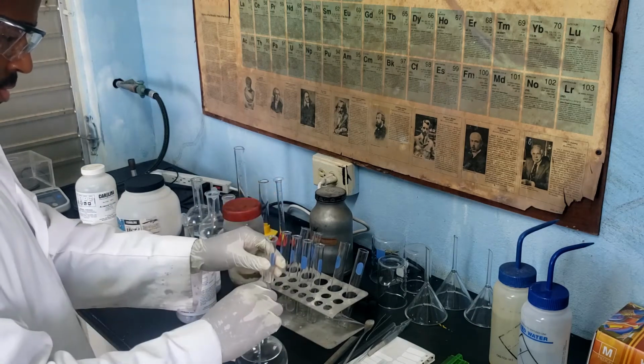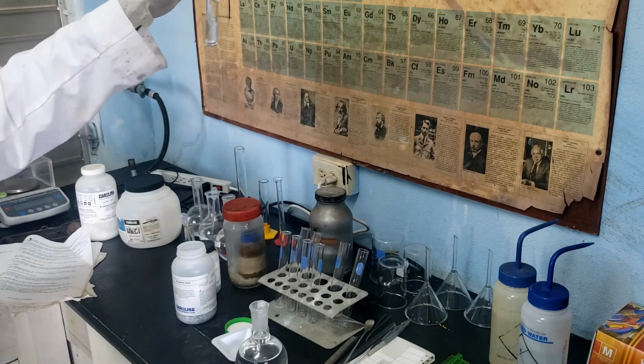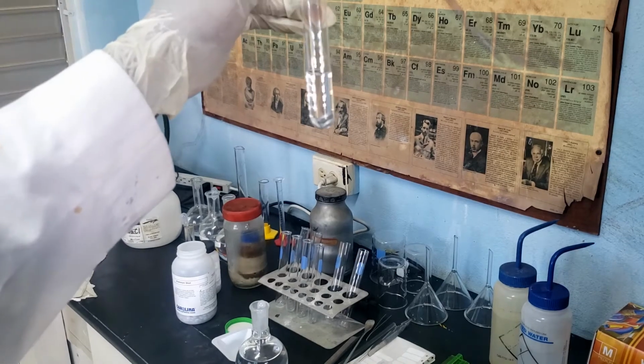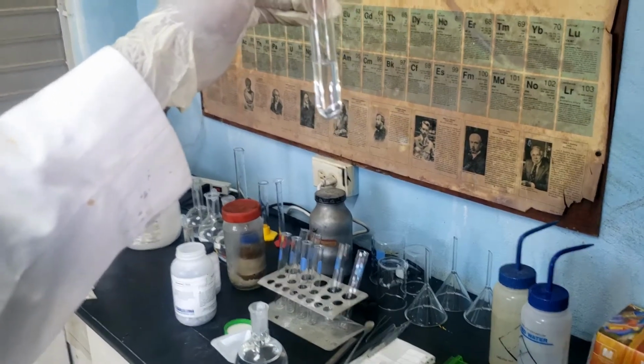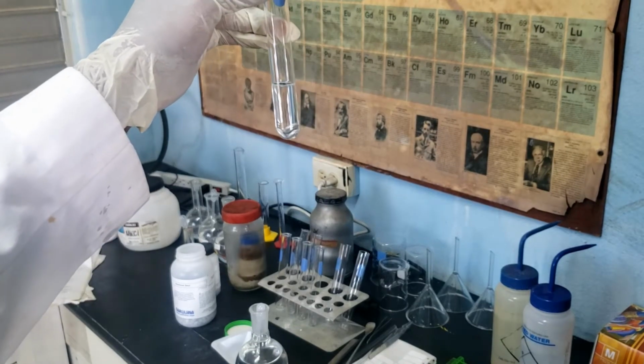In experiment 1, the aluminum shots are very slow to react with hydrochloric acid. Slight bubbling can be noticed upon the surface of the metal, and if left long enough, a reaction will occur.